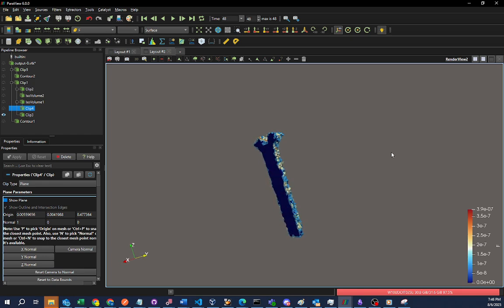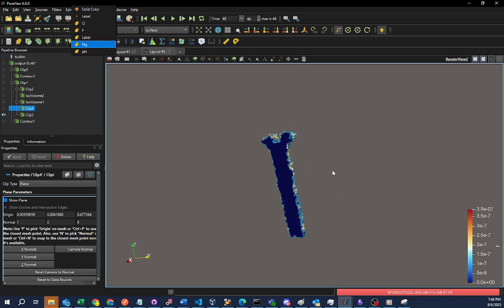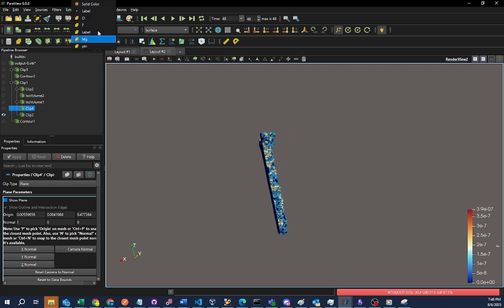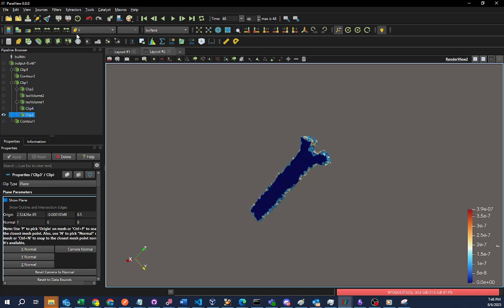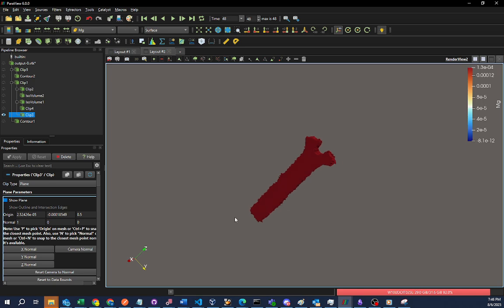This is half of a screw. Again, the fluorine doesn't really go inside. The fluorine can't really penetrate, it just goes in the surrounding area of the screw. The magnesium, okay, this actually is wrong. No, I was just selecting the wrong one. Okay, there we go. The magnesium actually exists inside the screw on the surface and then on the inside. That makes sense.